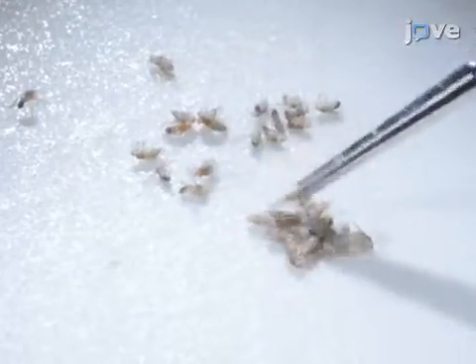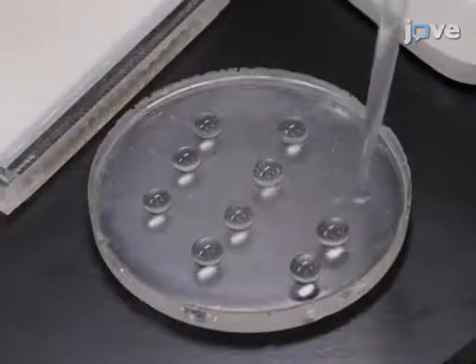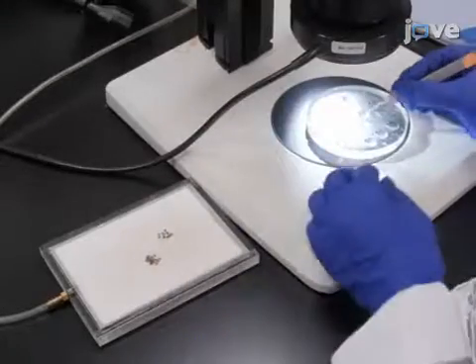Anesthetize the flies on a carbon dioxide fly pad and pick female flies with a paintbrush. Add several drops of room temperature Drosophila medium supplemented with 10% FBS to a dissecting pad and place it under a stereomicroscope.